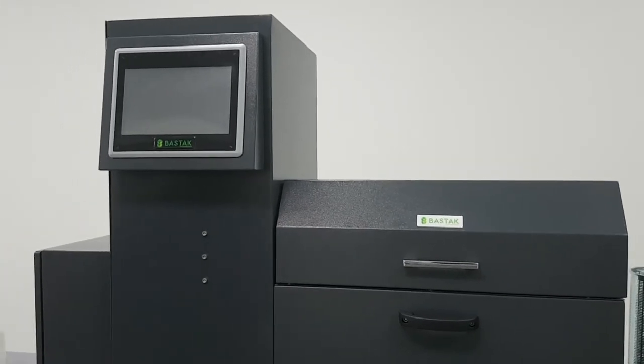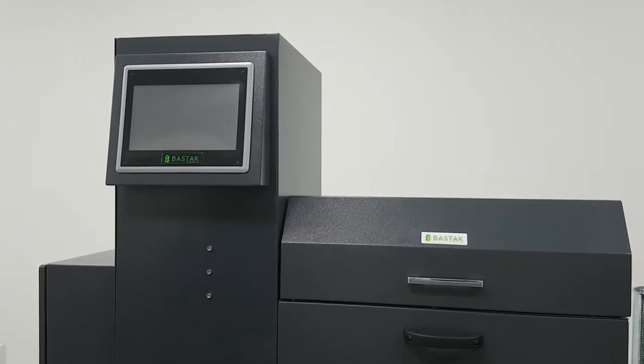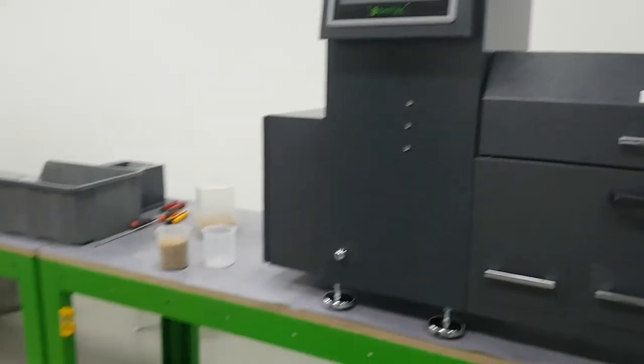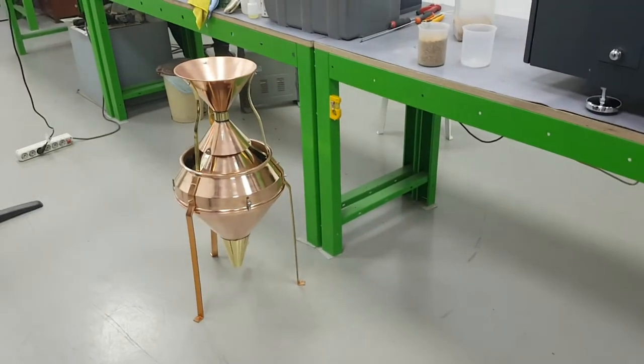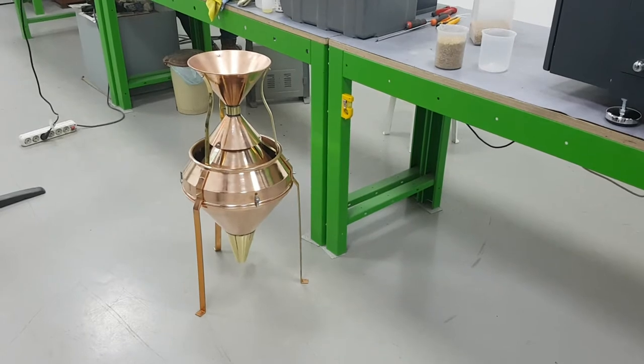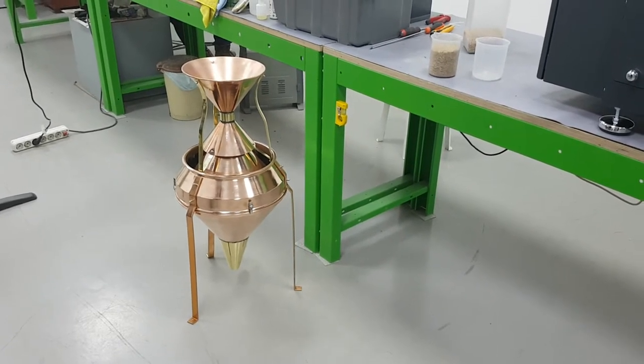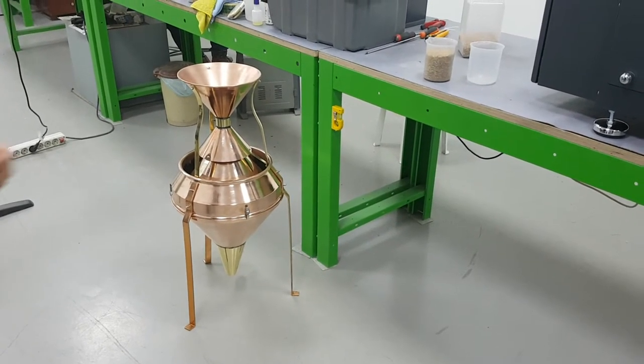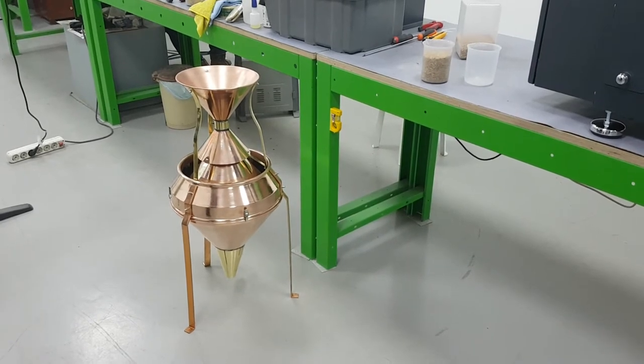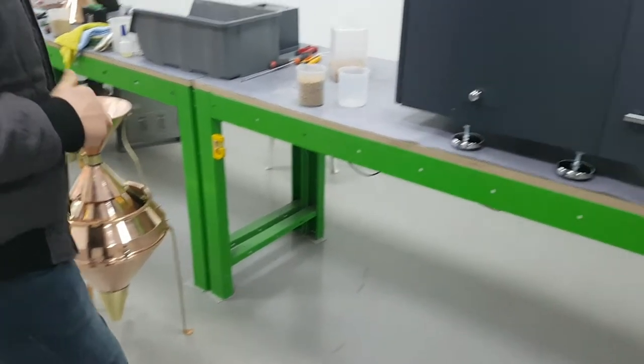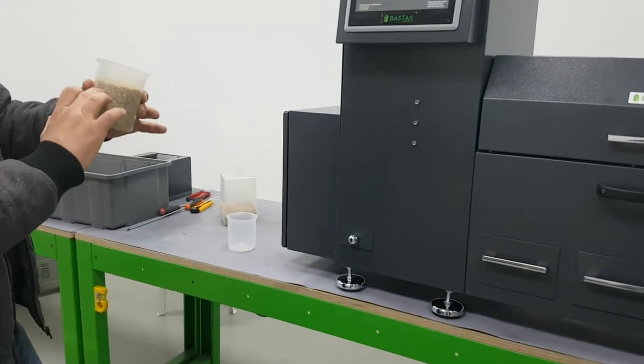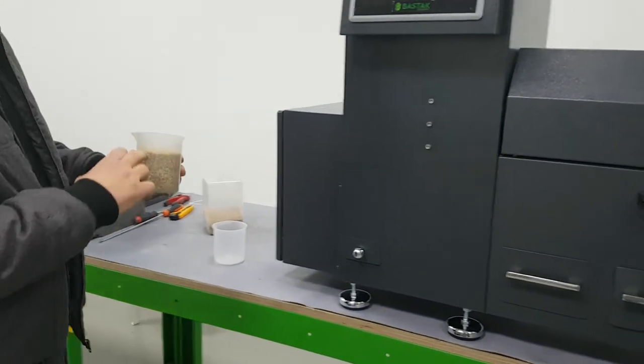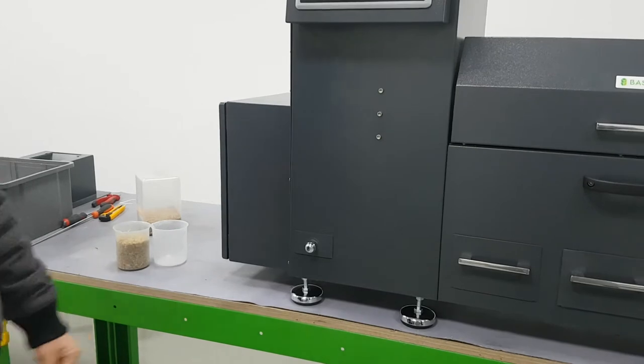In order to use this machine, first we should use the Sample Divider 13000 model Bastak brand. To get a homogeneous sample, we divide the sample into four samples when we take it from the truck. Then, by using this, we will get up to 300ml sample of wheat.